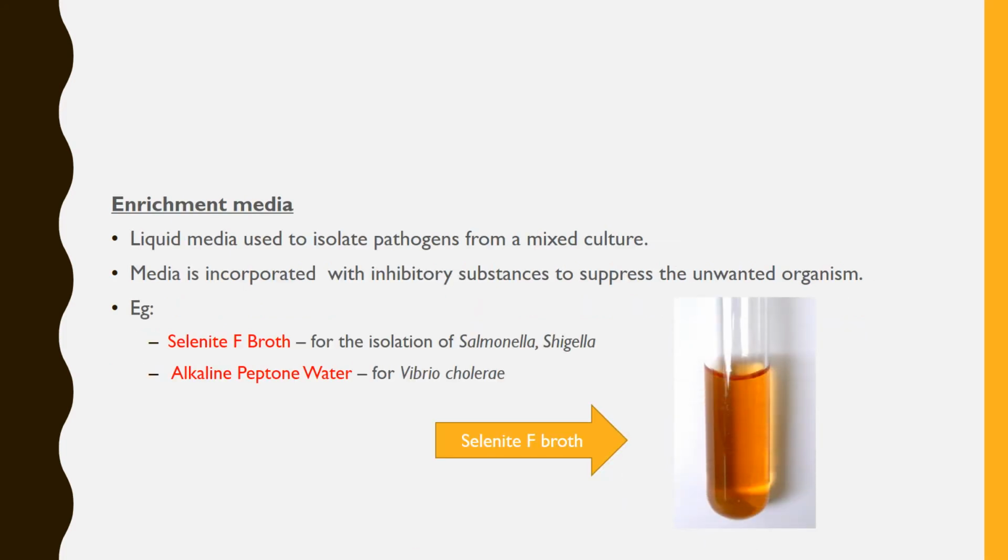What is enrichment medium? Enrichment medium is a liquid media which is used to isolate the pathogen from the mixed culture, and the media is incorporated with inhibitory substances which suppress the unwanted organism. Means in this, first of all, it is present in the liquid form.